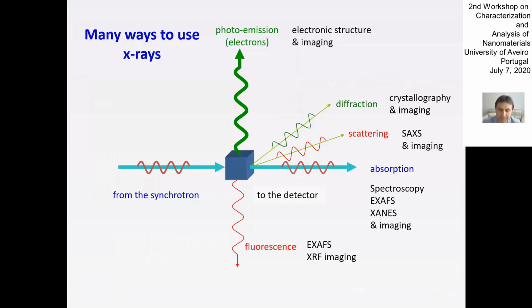Depending on the type of this interaction, we can make different types of experiments, say small angle X-ray scattering. But again, the topic of my talk is diffraction, so we will focus on diffraction.